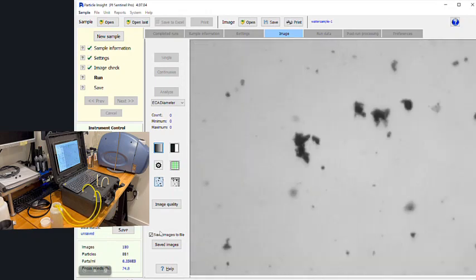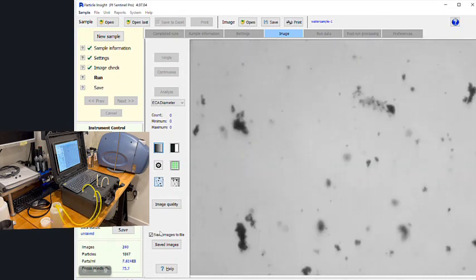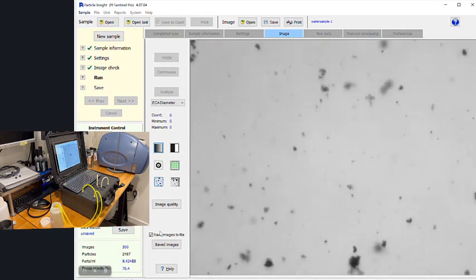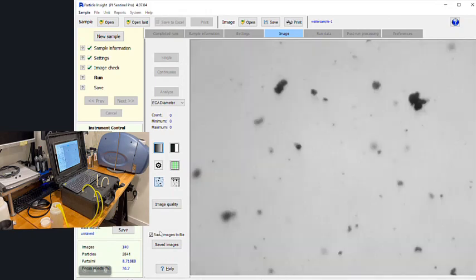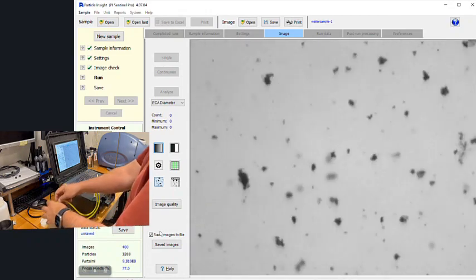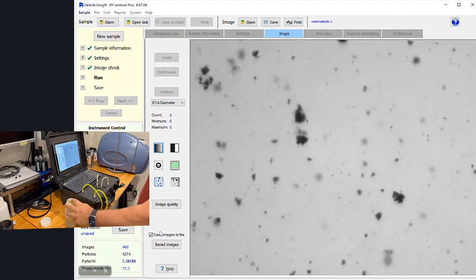A few other points I'd like to mention about the Raptor Portable is that it is battery powered. So when you are not in the lab, you can actually disconnect it from power, and you can actually just take it anywhere. It has a battery with about enough power for about 5 hours worth of work without being connected. The Surface Pro also has its own battery as well. In addition to that, being a Surface Pro tablet, you have the ability of having Wi-Fi when you're in the office, but also 5G.